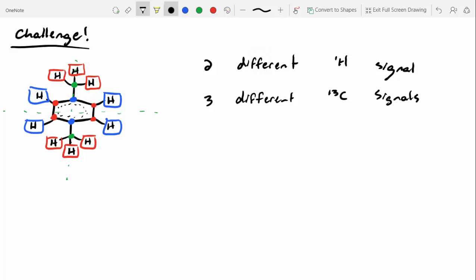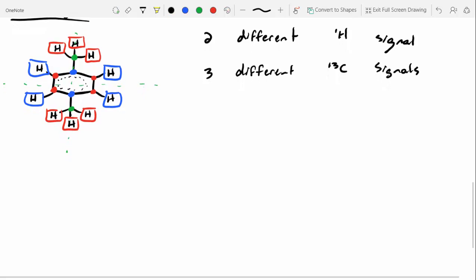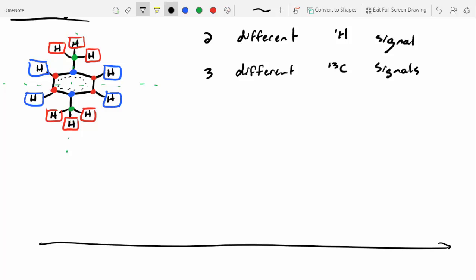All right, so before we head out really quick, let's just take a quick look at what the spectrum might look like. The scale that we use in NMR is typically in ppm, which is parts per million. Less commonly, you'll see it in hertz, and even less commonly, you'll see it in tau. But most of the time, when you look at NMR, the spectrum's in ppm.